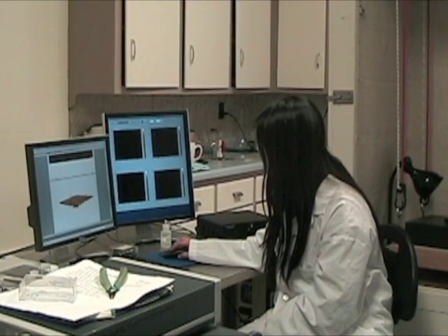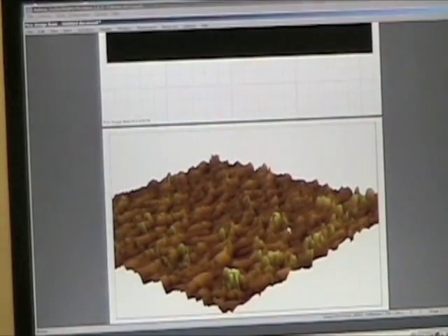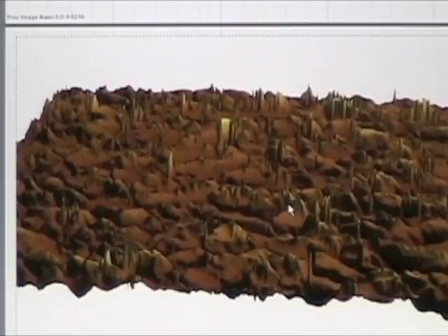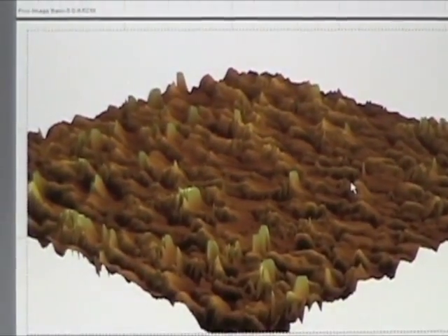After the image has been captured, it may be manipulated for view in several three-dimensional orientations. The image may also be edited so the actual views in surface topography may be determined. There are many irregularities that are not visible to conventional microscopes. The surface is not uniform. The maximum and minimum heights of the surface are below 1 micrometer up to 100 micrometers.